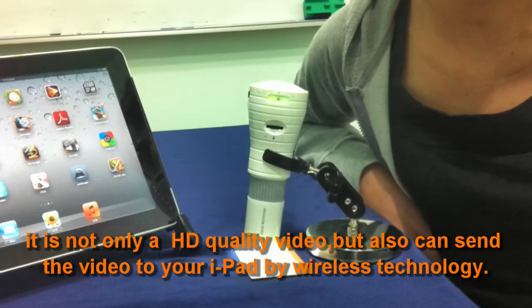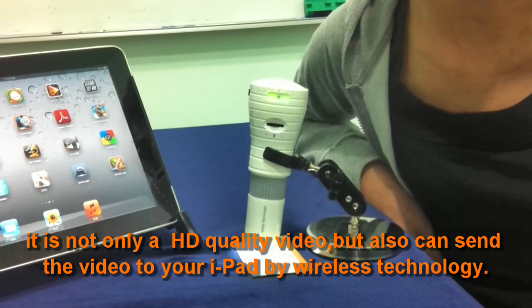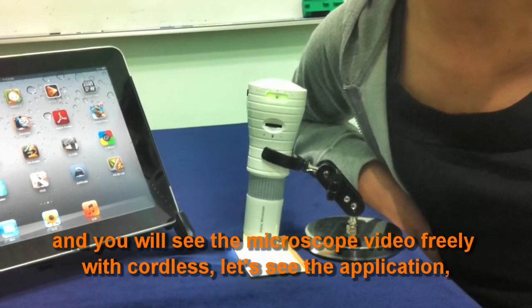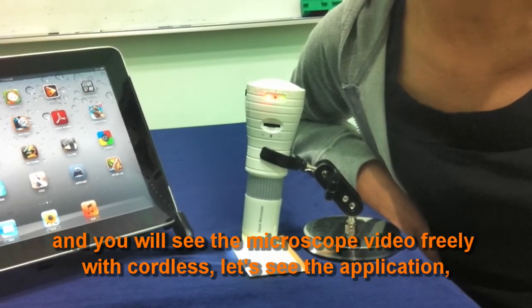It's not only HD quality video, but it can also send the video to your iPad by wireless technology. You will see the microscope video freely, cordless.